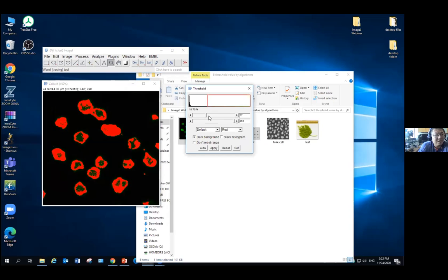So this part is where you manually choose the value. We choose it around, let's say what will be the best, so maybe about 44, I think 43. And also you have this portion. If you check on this, it gives you about 15, 17 names. These names are just the names of the algorithms they use to calculate this thresholding.